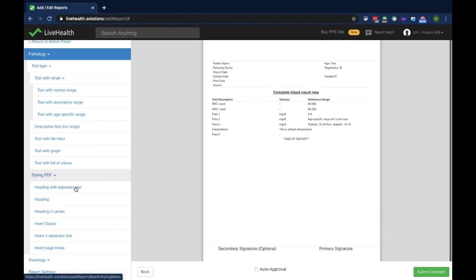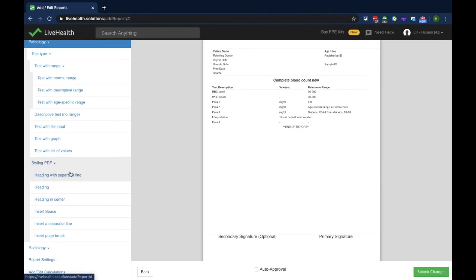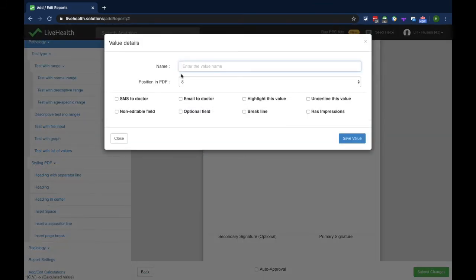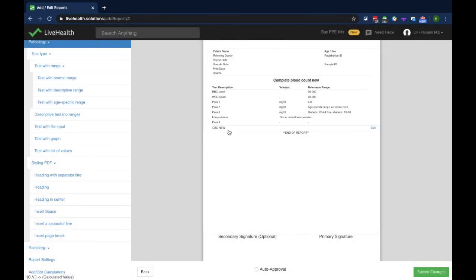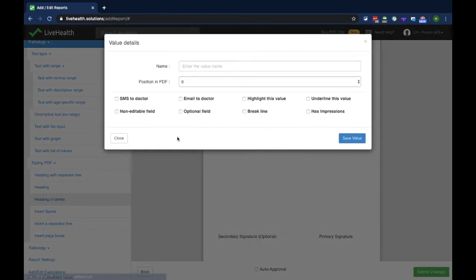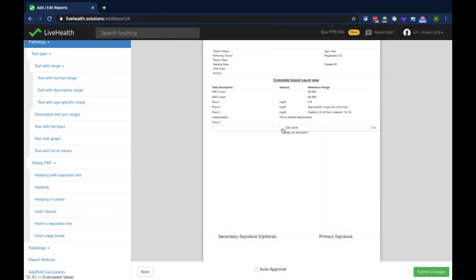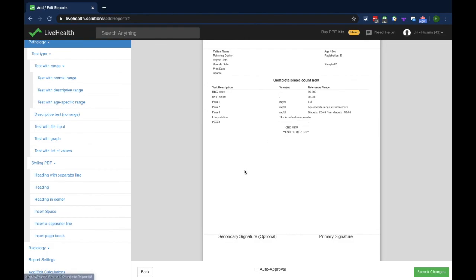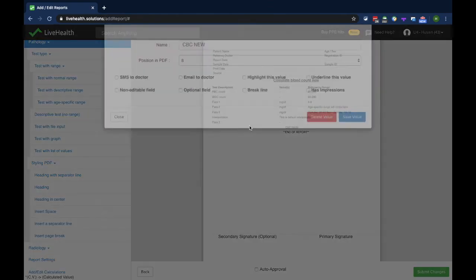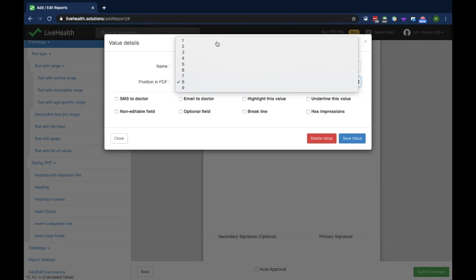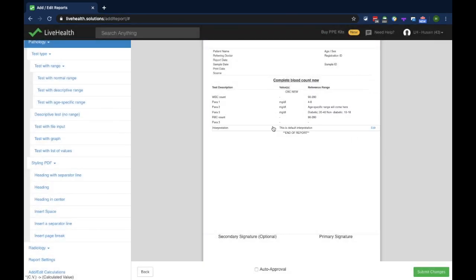Besides these, there are styling parameters which can be used to style the report format. You can add a heading or a heading in center. There are also other parameters like space or page break which can be used to format the report. If you want to change the position of parameters, you can click and drag to reorder them. This is how you can add different parameters in the report format.